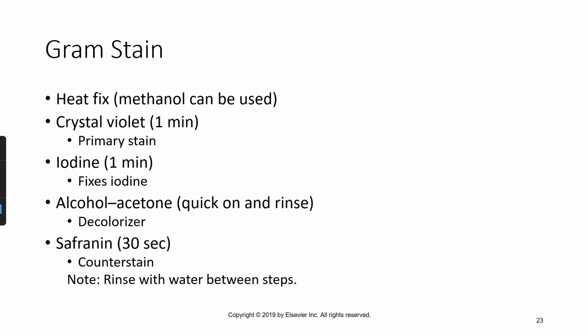So the gram stain procedure, this should be a bit of a review of the procedure, but first step is to heat fix, but methanol can be used. So when we get the specimen on the slide, step one, we would want to kill the bacteria and cause it to stick to the slide. In the clinical lab, we don't use open flame for obvious reasons. We're in a hospital, we don't want fires, we don't want our oxygen lines that are helping our patients survive be exposed to flames. It's just a bad idea altogether to have open flames.